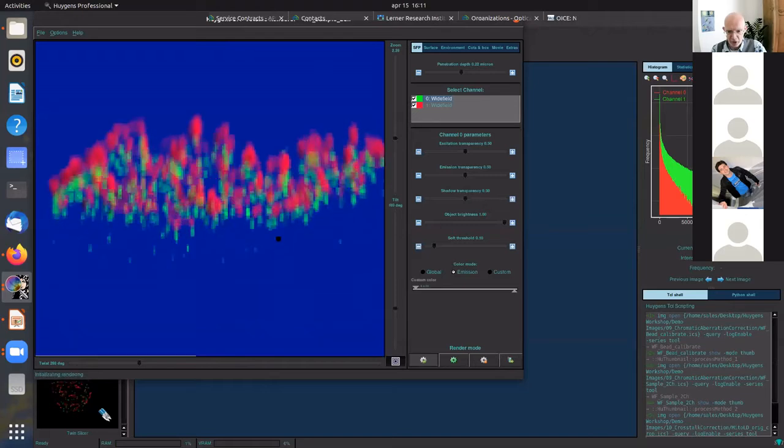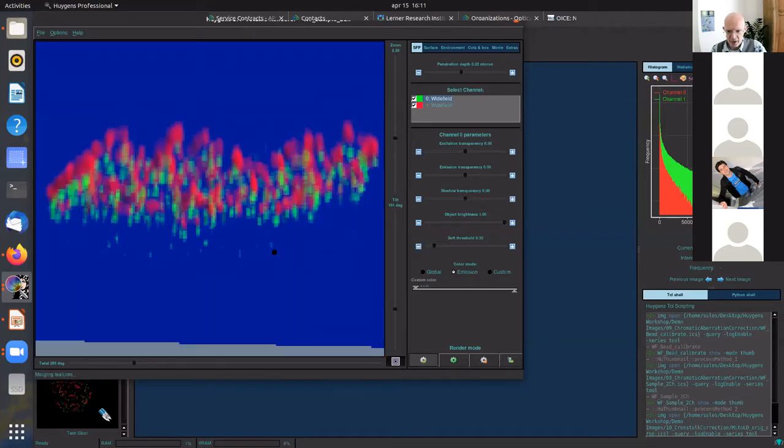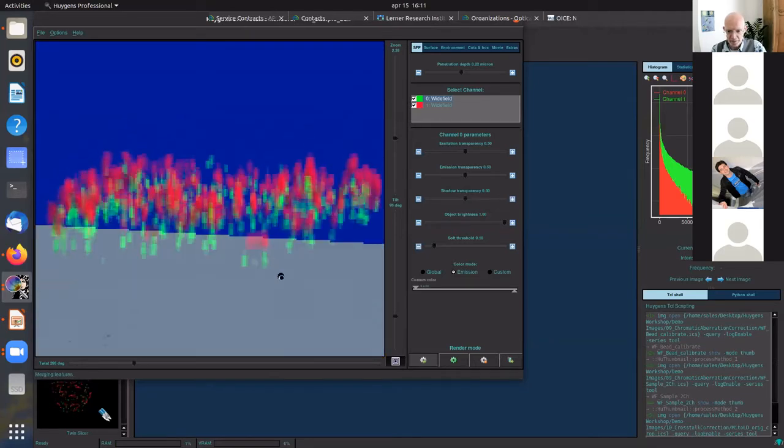Wouter already introduced you during the Decon Wizard demo to this image. So this is a kinetochore complex of a dividing cell, kinetochore proteins. And if I render in higher mode, you see more detail of this. So all the renders show you clearly misalignment.